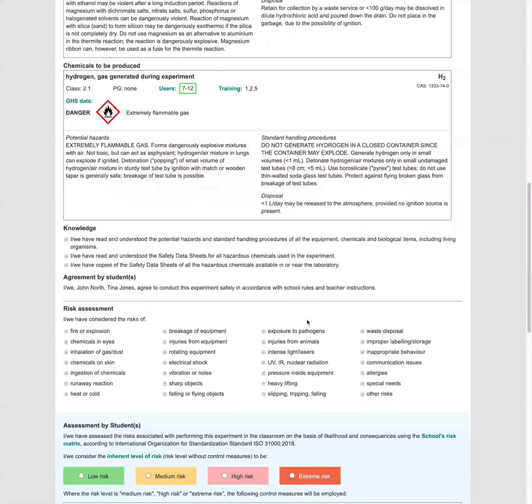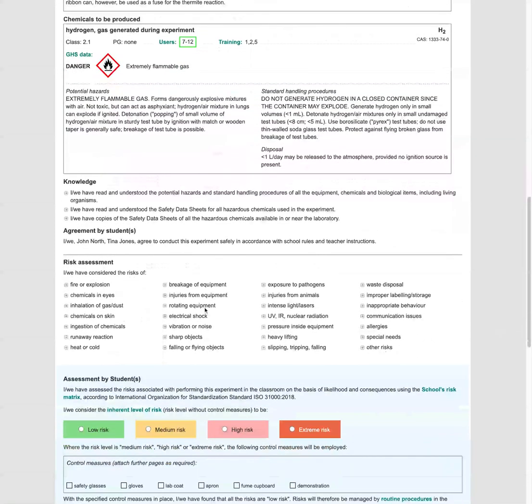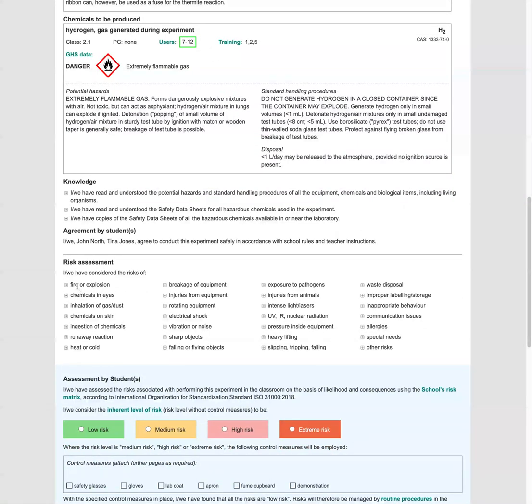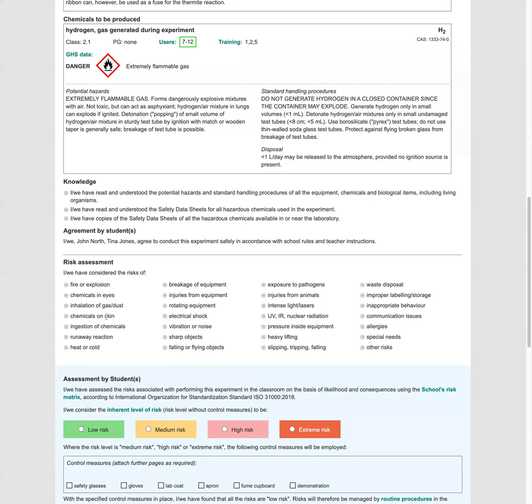So let's go ahead and do the actual risk assessment. So let's have a look at the risks to consider for the most relevant ones. So fire, definitely. We've got the hydrogen gas that could catch fire. The explosion, probably not an issue because our test tube is going to be open. Now we've got the irritant chemicals in the eyes, chemicals on the skin. We'll have to keep those in mind in our control measures.